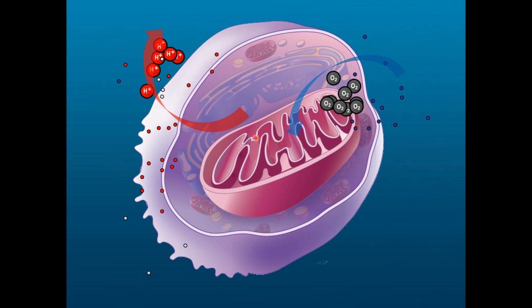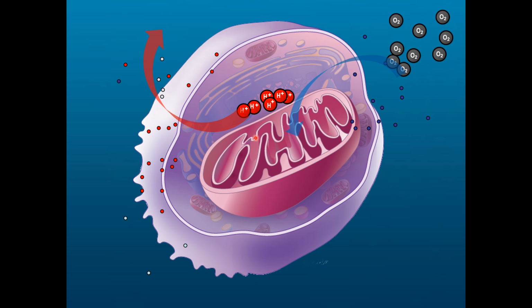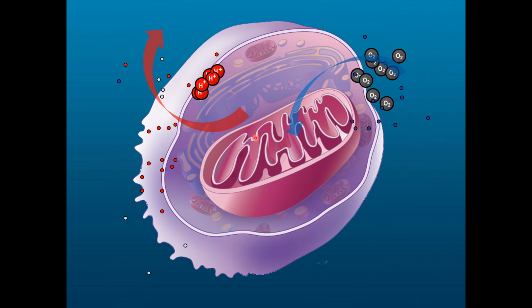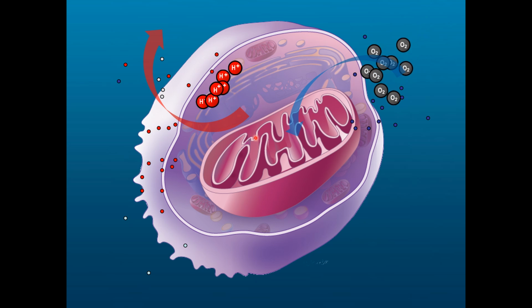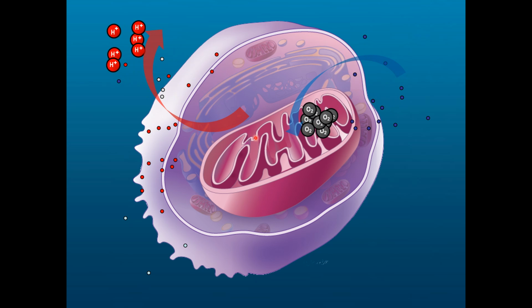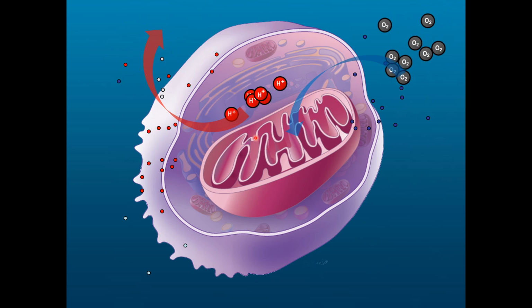Luckily, oxidative phosphorylation will consume oxygen around the cell. So if the cell consumes oxygen faster, or more oxygen is consumed, you can think, oh, this cell has better mitochondria, a better efficiency. In the other way, glycolysis will produce lactate. Lactate will pump out or diffuse out of the cell membrane and produce protons.